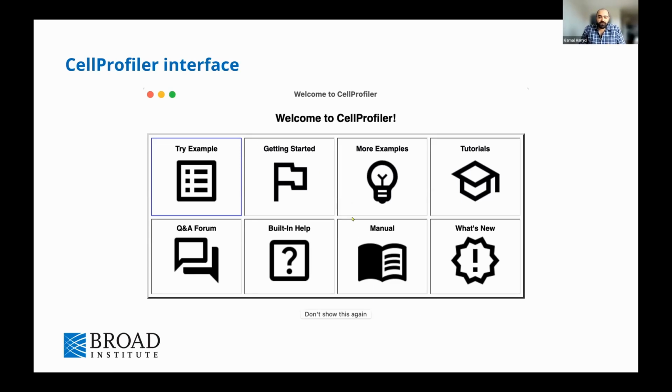What you can see here is that there are certain icons that you can click in order to get different examples for you to try out the software when you're just getting started. You can go here to the tutorials, to see the list of tutorials that we have on the website, which extend well beyond the beginner segmentation, and of course include PDFs and oftentimes video demonstrations. And you can also go to the Q&A forum that accompanies the software, image.sc.